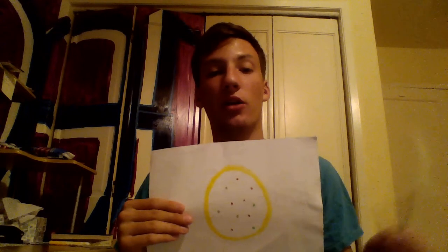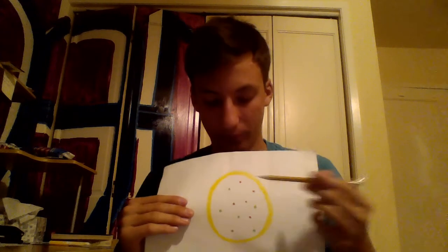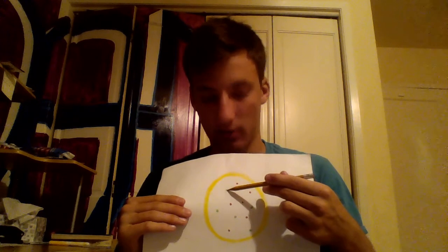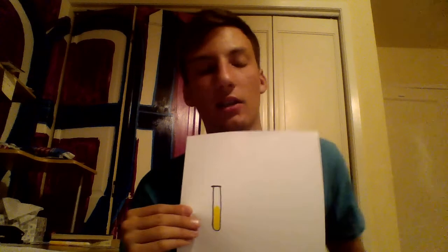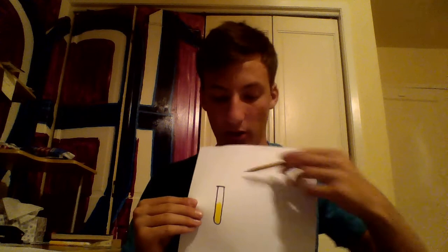So in lab we'd go and take a sterile stick, which I'll just represent with a pencil, and I'll take out the little colony and put it in a test tube that has LB broth in it. LB broth is just a liquid that has nutrients that are essential for the bacteria to grow. So we go in and put our colony in there.